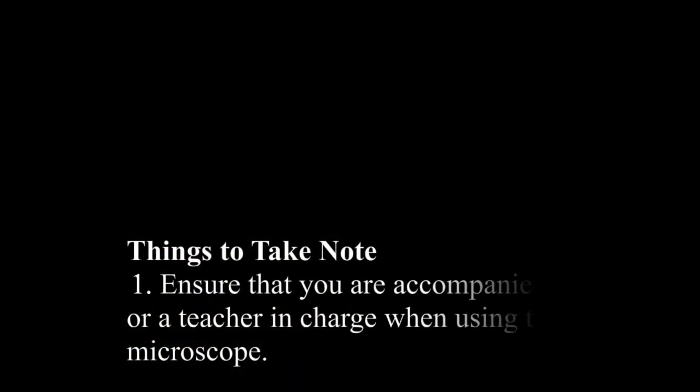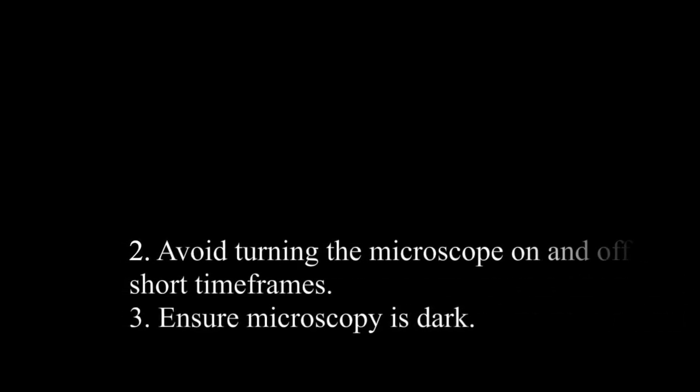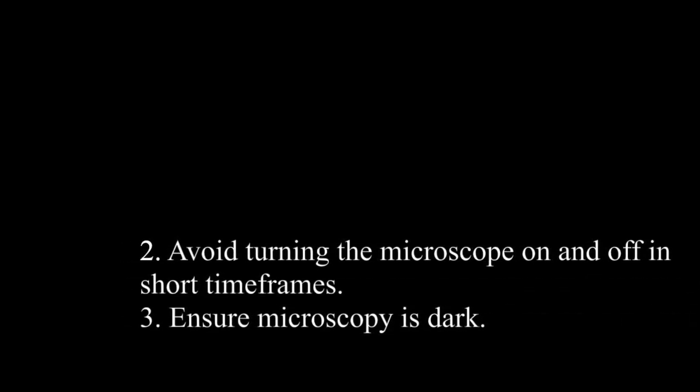Things to take note. Ensure that you are accompanied by a TSO or a teacher in charge when using the confocal microscope. Avoid turning the microscope on and off at short time frames. Also, make sure that the microscopy room is dark.